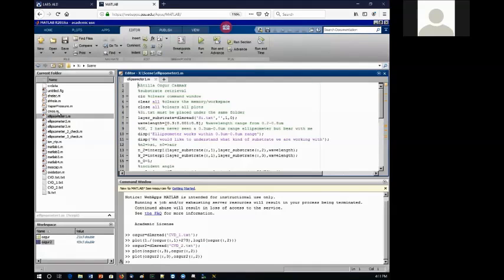Yeah, it won't work with you guys because you don't have that silicon. I'm talking to the folks here. Forgot to give them the silicon.txt. So ellipsometer1.m. Ellipsometer can also be used to find out what kind of a substrate we're looking at.